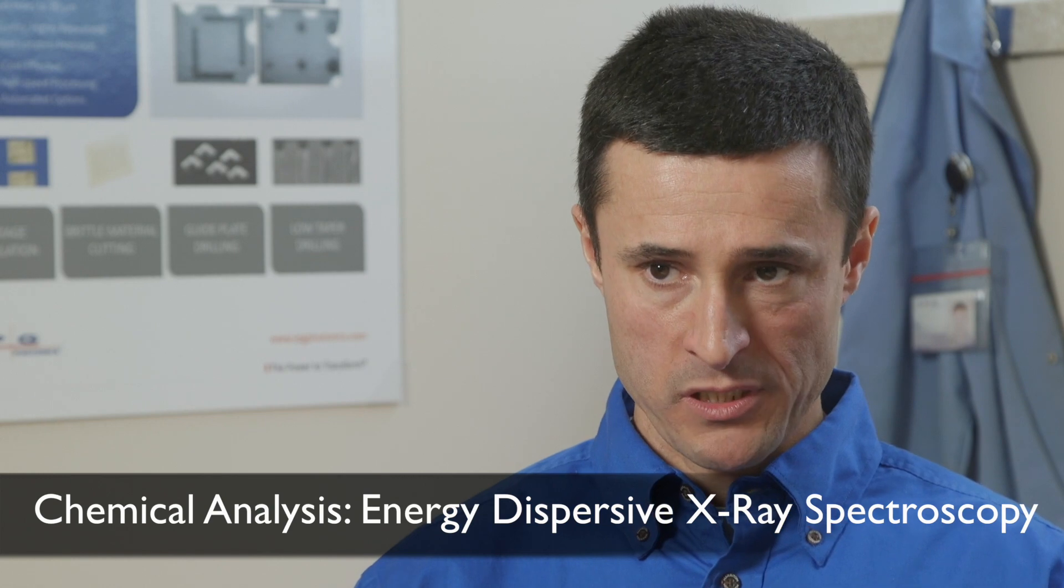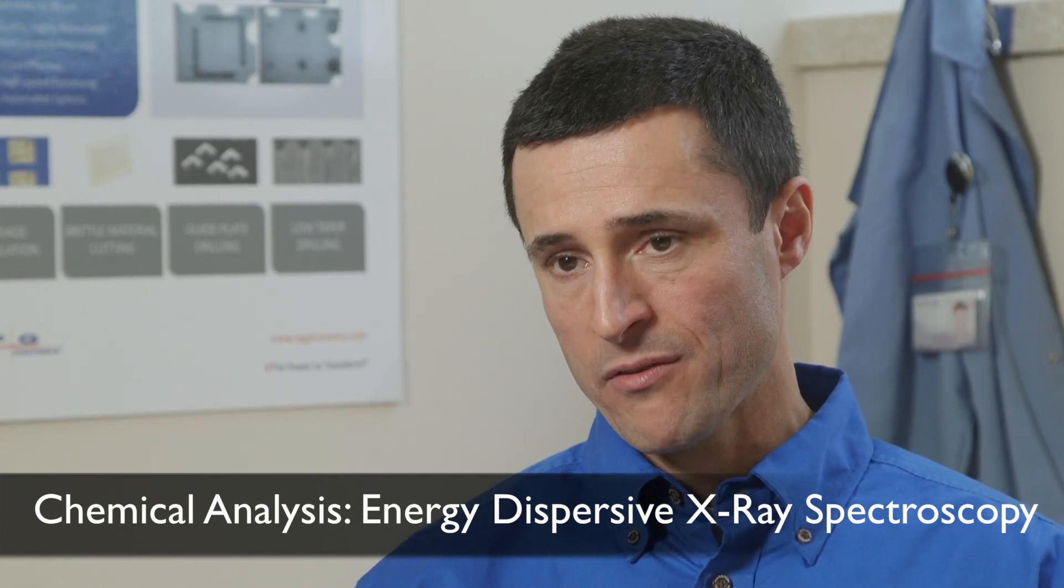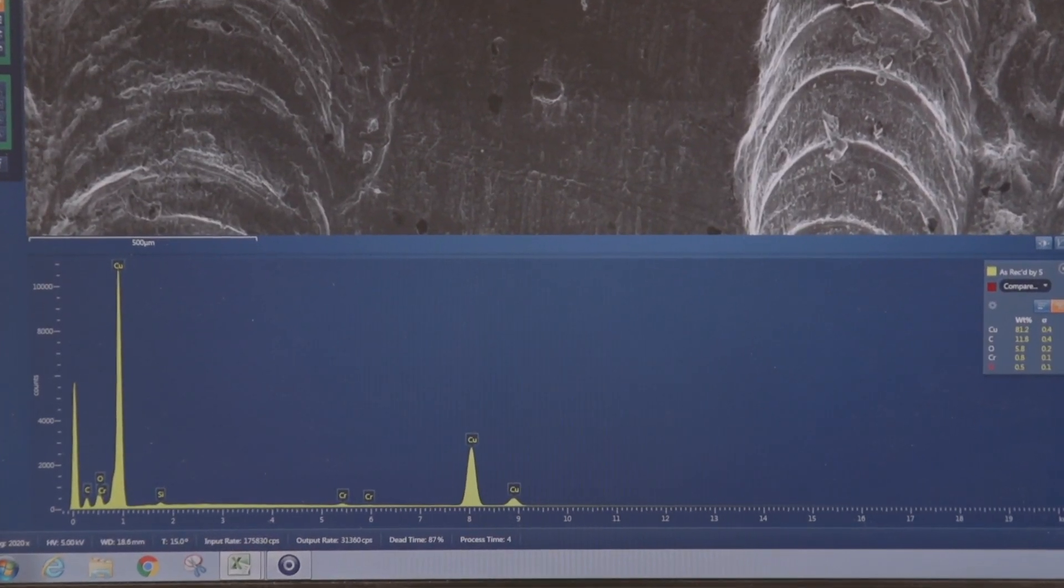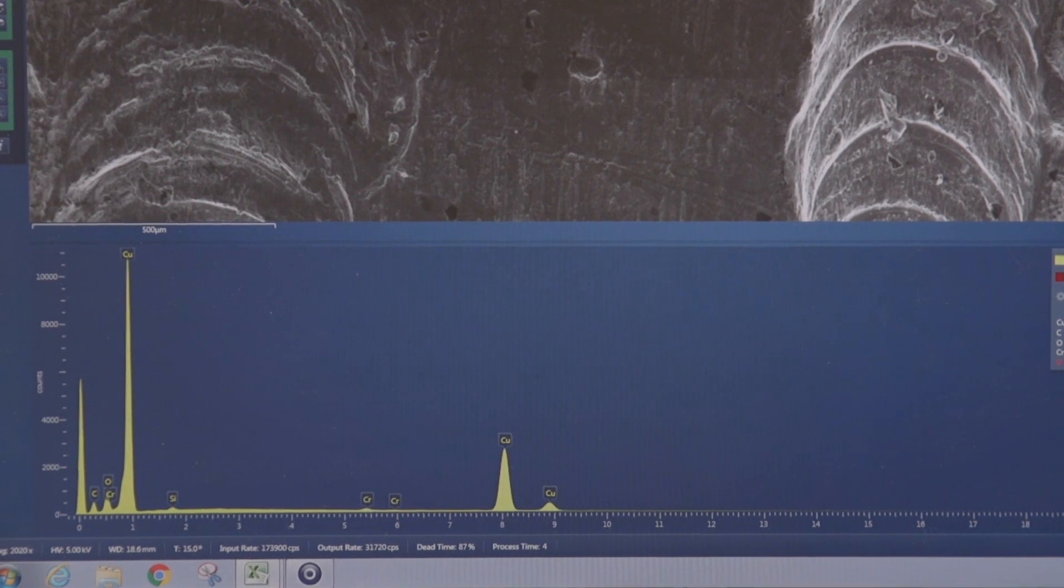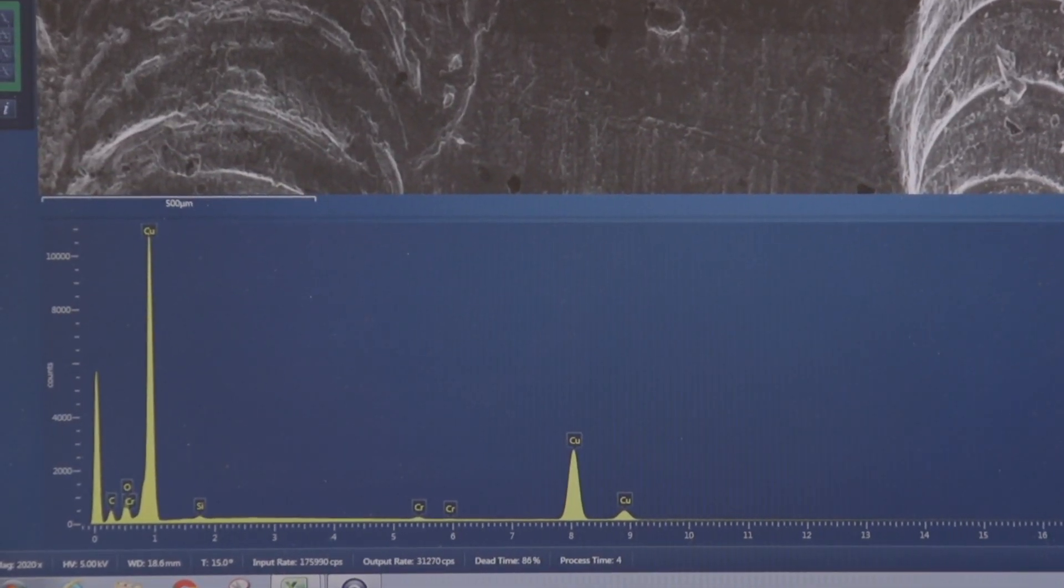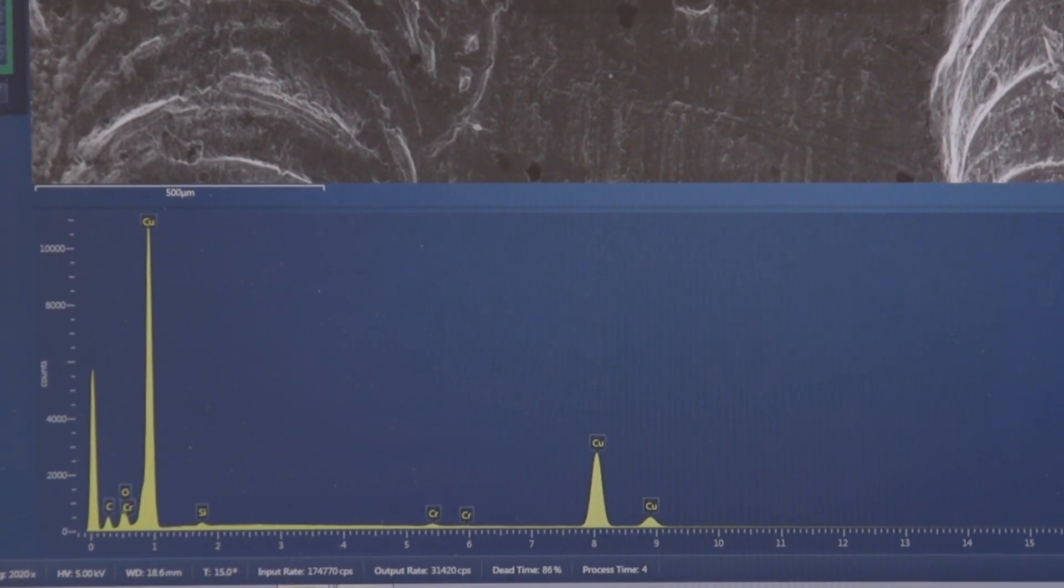Energy dispersive x-ray spectroscopy is one of the tools that we have. Here you basically focus an electron beam on the sample, typically using the SEM, and you capture the characteristic secondary x-rays that are emitted by the sample. By analyzing those, you can understand the elemental composition of the sample.